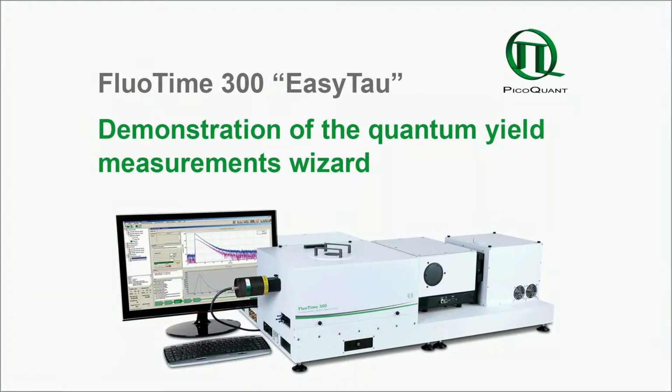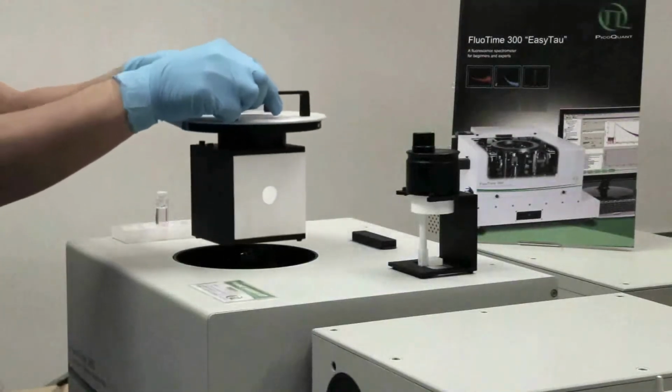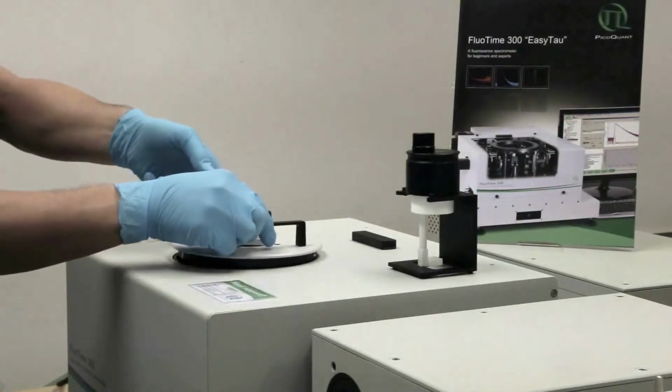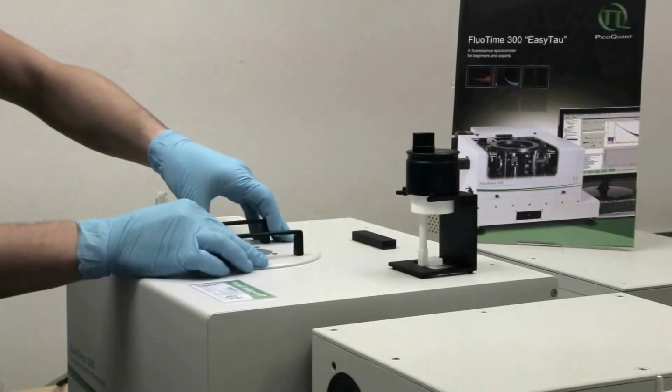In this example, we will show the measurement of the fluorescence quantum yield of Rhodamine 6G in ethanol with an integrating sphere. The measurements are performed in the FluoTime 300 EasyTau. The first step is to insert the integrating sphere. Please insert the integrating sphere with caution in order to not hit any optical elements in the FluoTime 300.